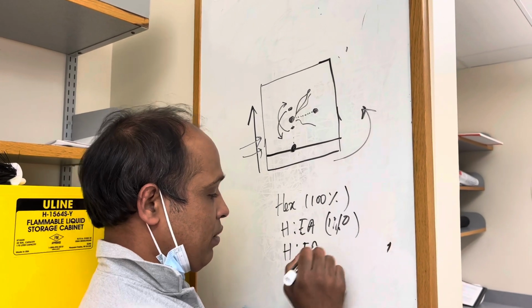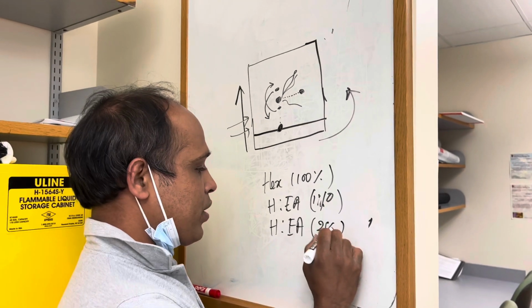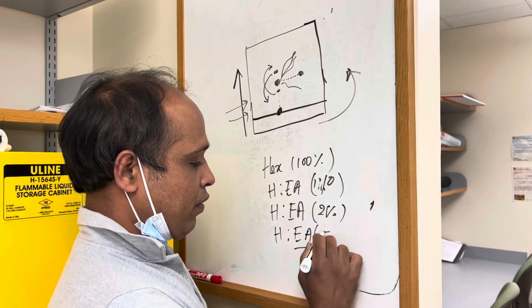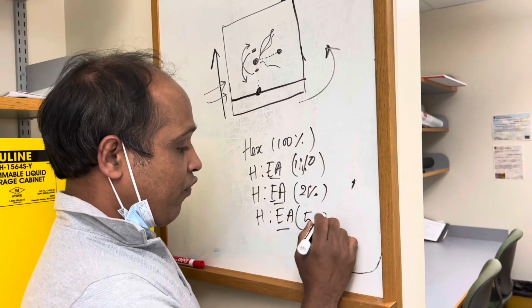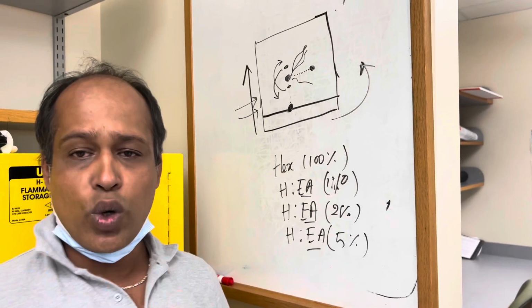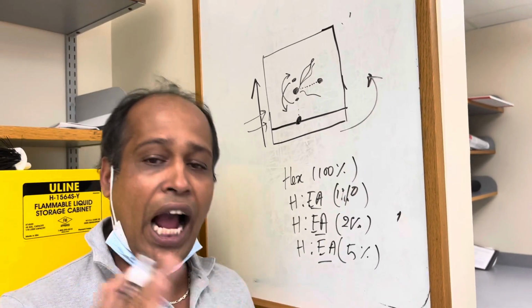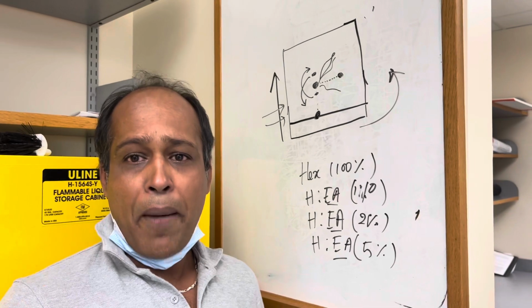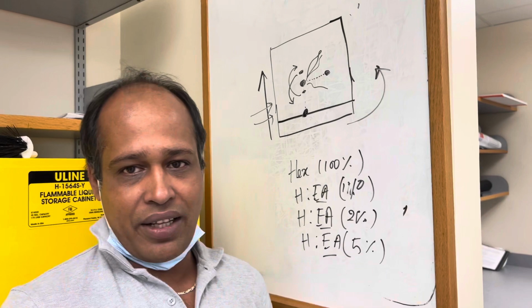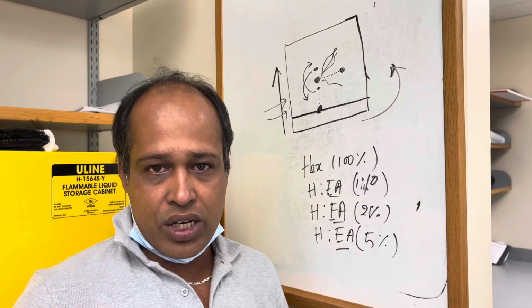Before, when you are starting the reaction, try 2% ethyl acetate in hexane, 5% ethyl acetate, 10%, 15%, and 20% ethyl acetate. And then see the pattern, how those are looking. I know this comparison is very tiresome, but at least the first time you are doing the reaction, you have to study that reaction with the crude, play around, and see which gives you the better resolution.